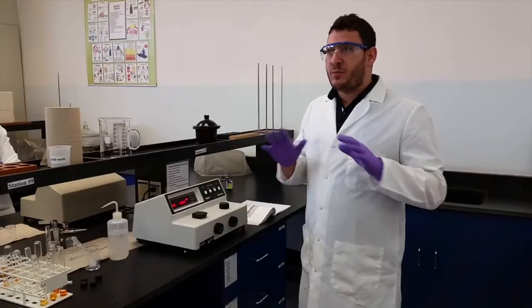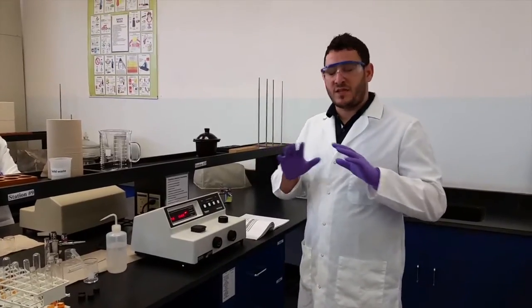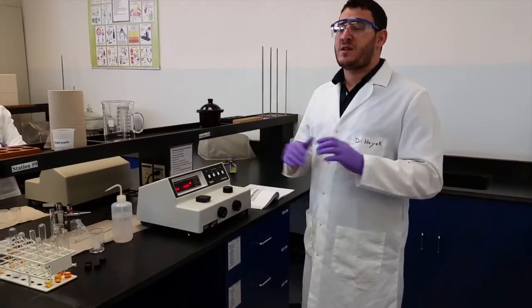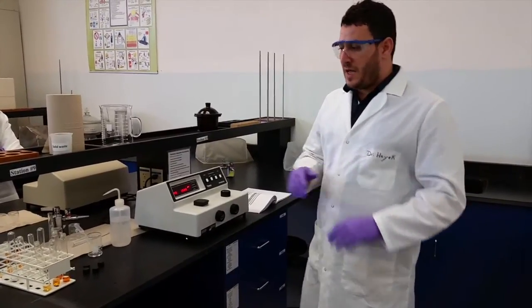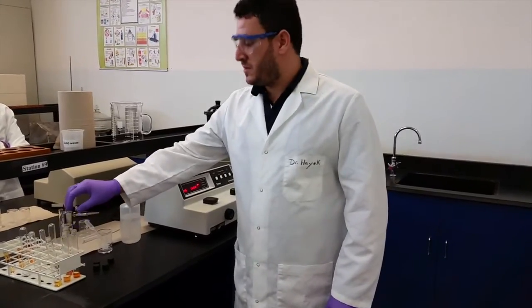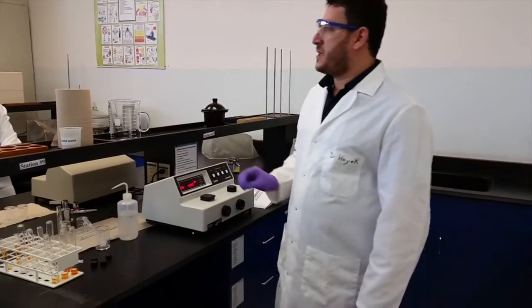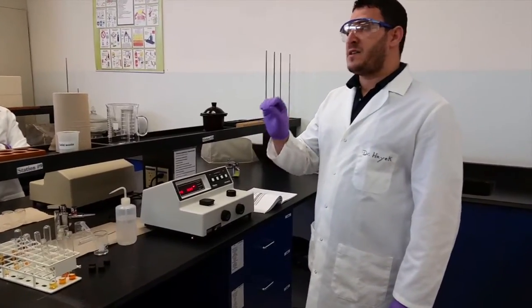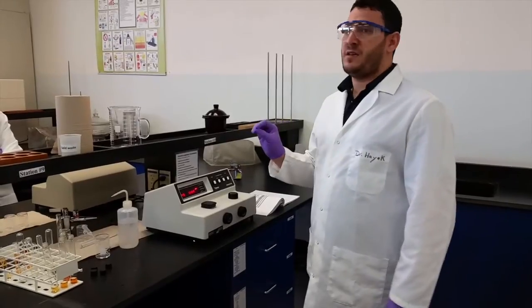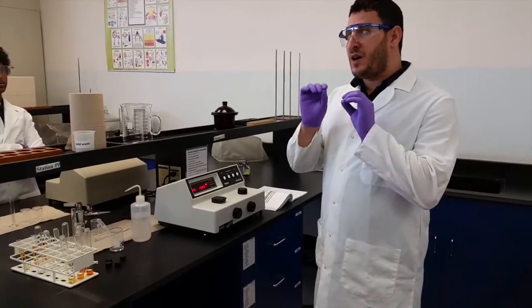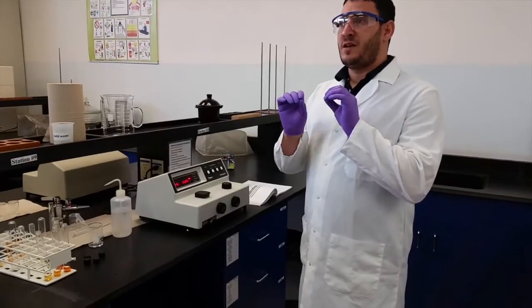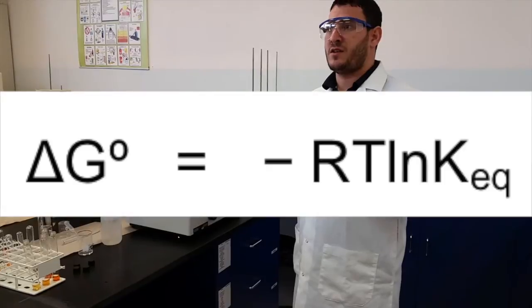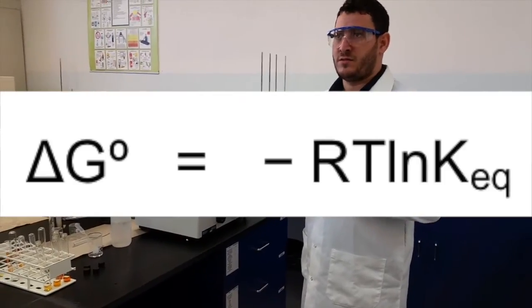There's a very important thing you should not miss: the temperature is constant. I have four different mixtures, four different concentrations. The value of the equilibrium constant has to be always the same because it depends only on the temperature, not the volume, concentration, or pressure.